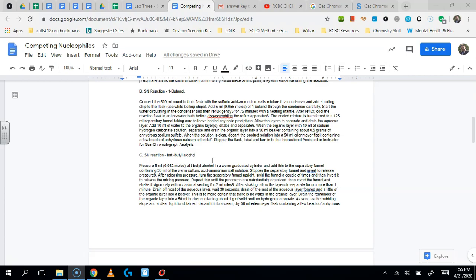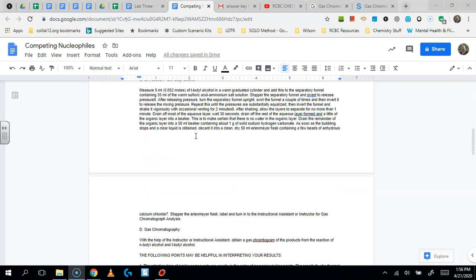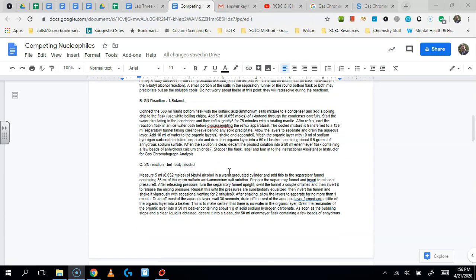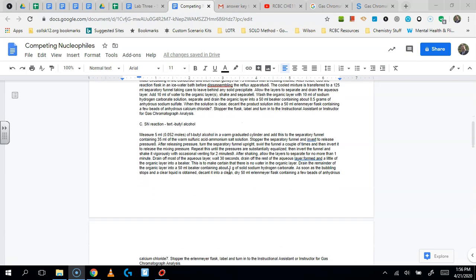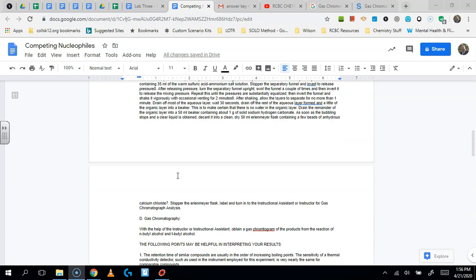If you react that with chloride and bromide, both of which are nucleophiles, and let the reaction do its thing, you should be able to see what the ratio of t-butyl chloride is to t-butyl bromide. You would normally spend a lot of time making sure that everything is up to speed and that it's equal molar amounts and things like that. But the write-up of this lab doesn't really need you to do the lab in order to get this.